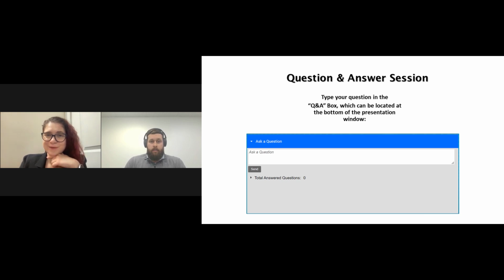Fantastic. Okay, next question here for you. If we have 3 detectors, can we configure 3 lines in the new version of the software? Currently, no. We can still only configure 2 analytical lines within the software. That is an improvement that we're pushing pretty hard on Shimadzu's side of things. We're hoping to implement that soon.